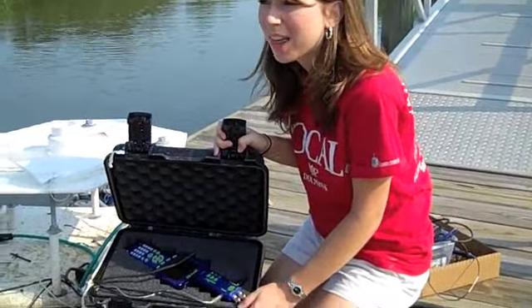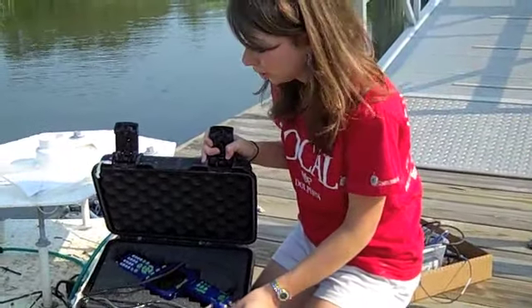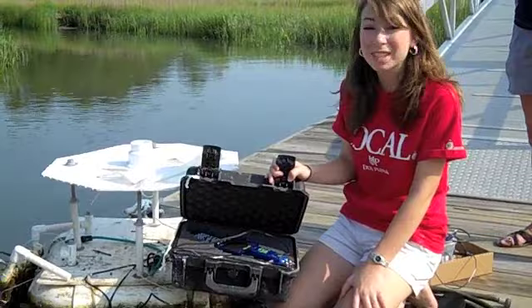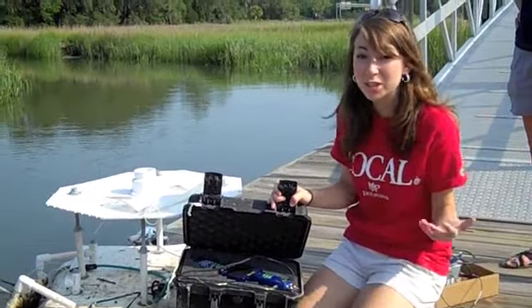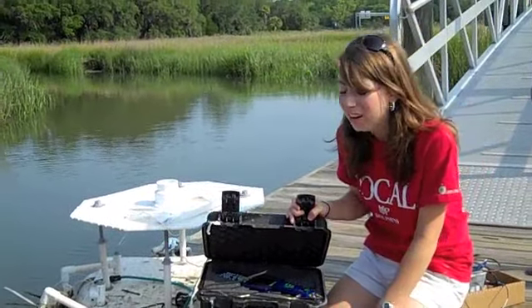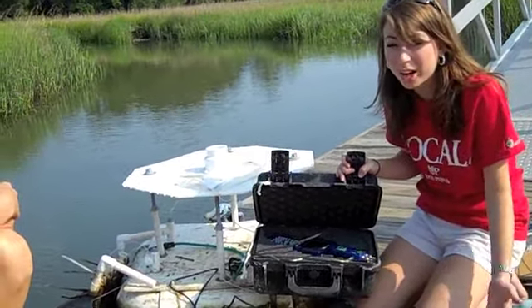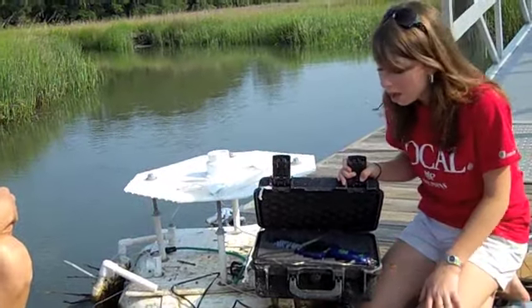We have to make sure that everything's the way it should be, especially making sure that we're not getting too polluted. We're collecting information about the salinity in the water because if the salinity is too high or too low, it affects the wildlife, and that's not good. And we're testing for dissolved oxygen, how much oxygen is in the water, because if there's too much or too little.